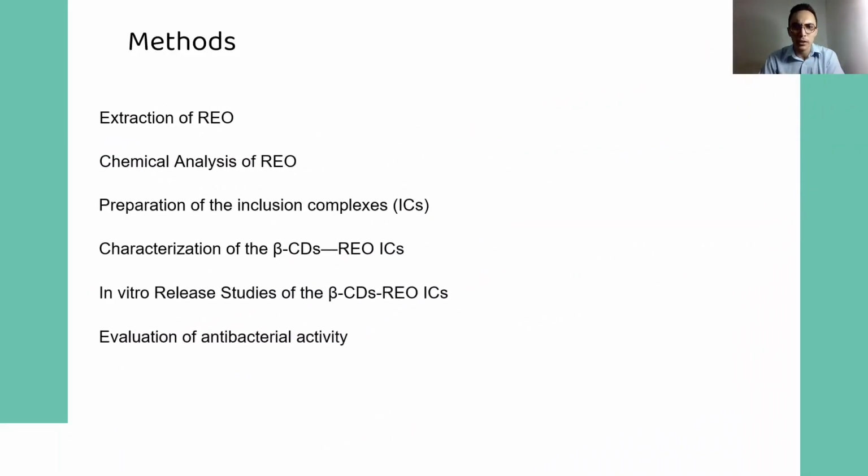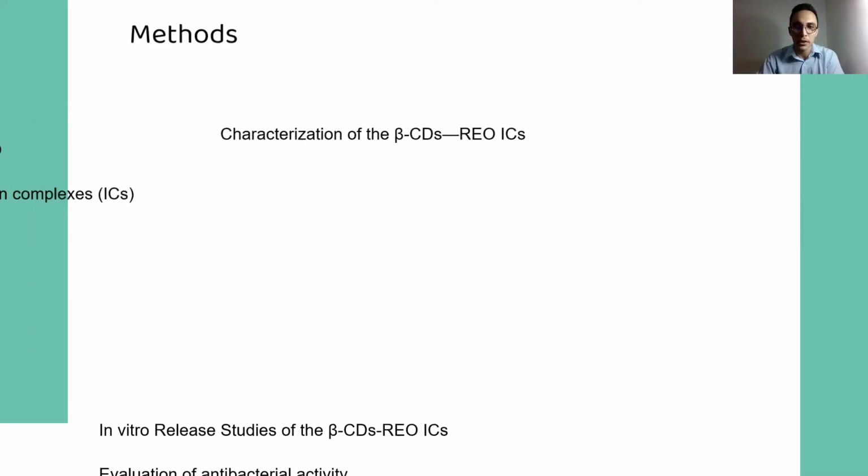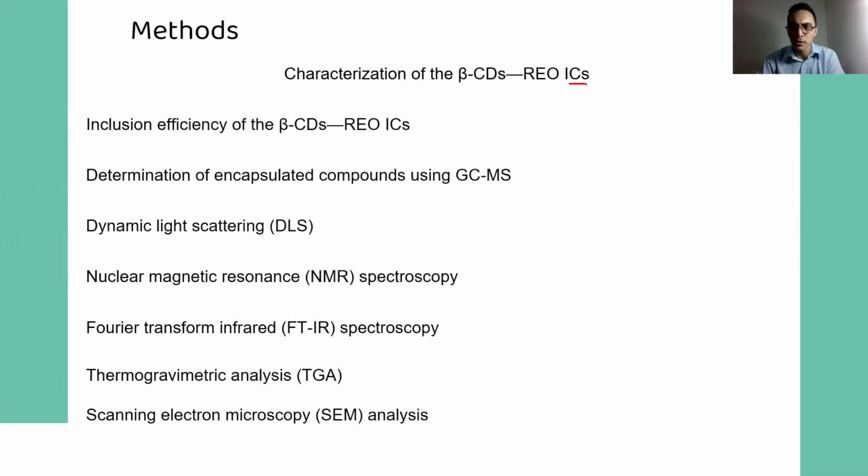The next step was the characterization of the cyclodextrin and essential oil inclusion complex.